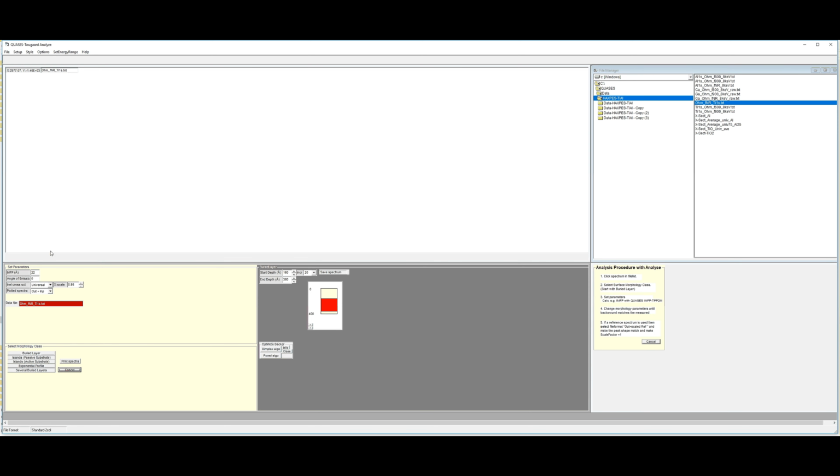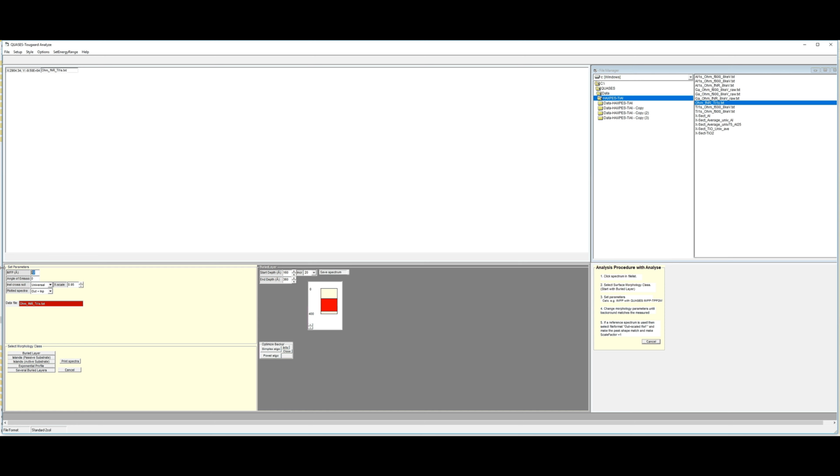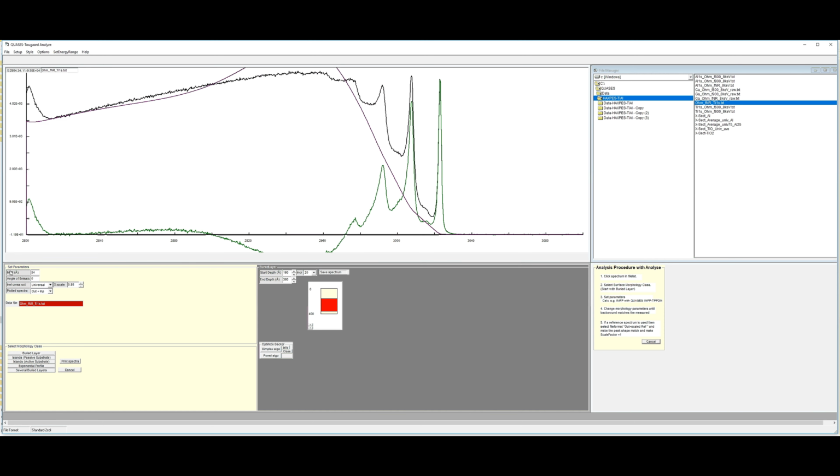We hit analyze, and we need an IMFP. I've already loaded that here. The peak is at 3020 eV roughly, and for aluminum we have an IMFP of 58 angstroms, as you see. For titanium, at the same energy, we have 51. So 51, 58, that's about 54. So we put in 54 for the IMFP as the average value. And now we analyze this.